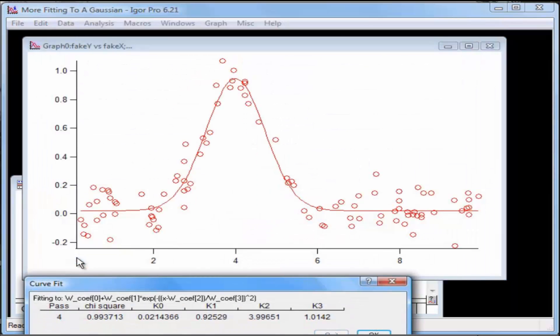During the fit, you will see the Curve Fit Progress window. When the fit's converged on a solution, the window will display the final parameters.